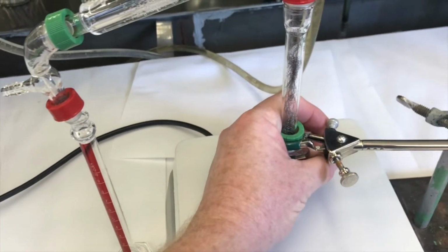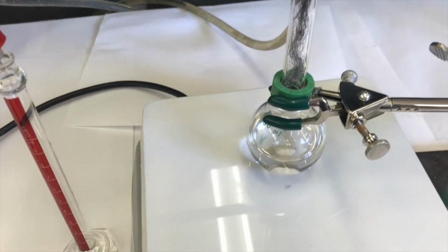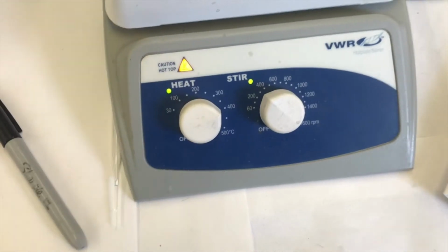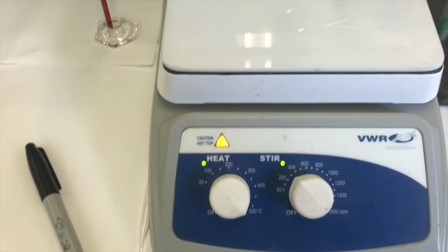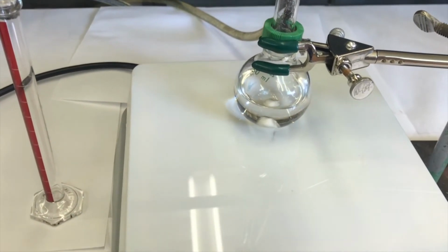Maybe I'll wrap just a little paper towel at the beginning, and we'll watch it, and I'll keep wrapping paper towel as we go on. I'll wait until it starts boiling, and then I'll do the paper towel wrap. I got impatient. I turned it up to 400. Maybe I'll just go full blast 500 and see what happens. I'll watch it carefully. Once it starts boiling, I can back off on it.